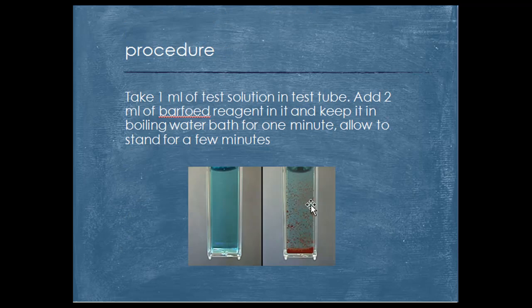You can see the presence of a red precipitate in the sample. The presence of red precipitate confirms the positive test.